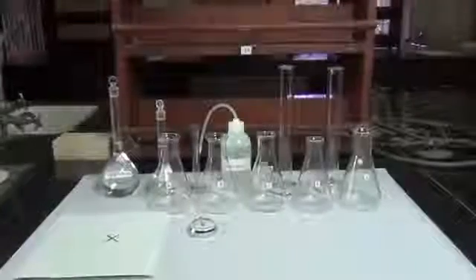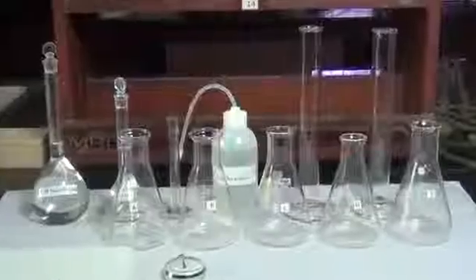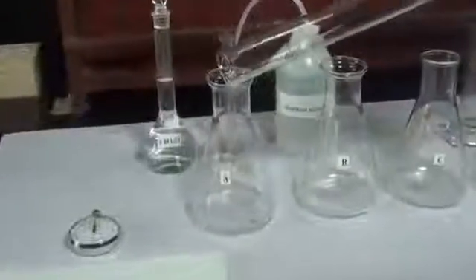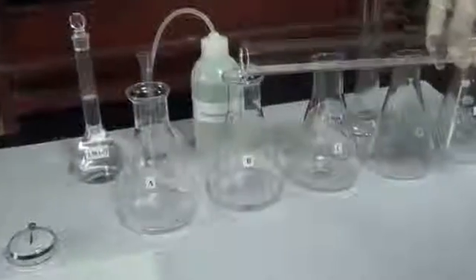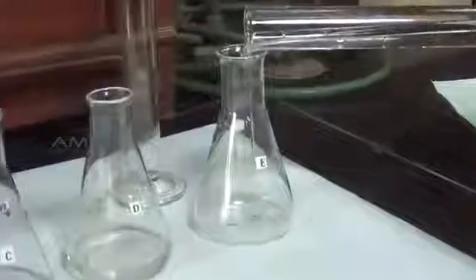Procedure: Take 5 cleaned conical flasks labeled as A, B, C, D and E respectively. Add 10 ml of 0.1 molar sodium thiosulphate solution to flask A, 20 ml to B, 30 ml to C, 40 ml to D and 50 ml to E.